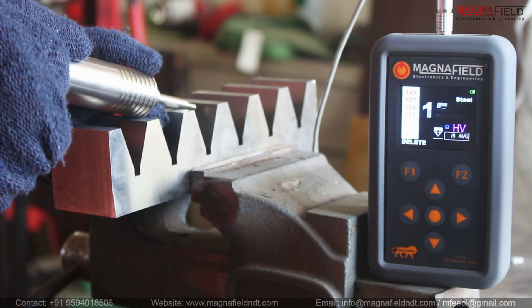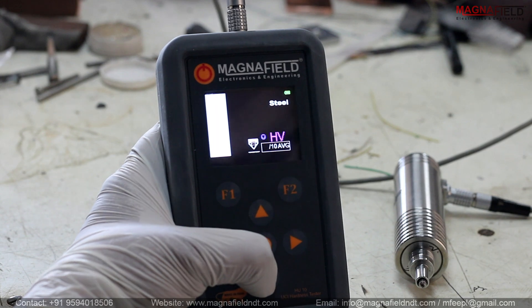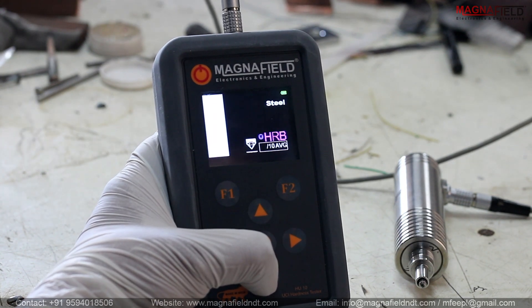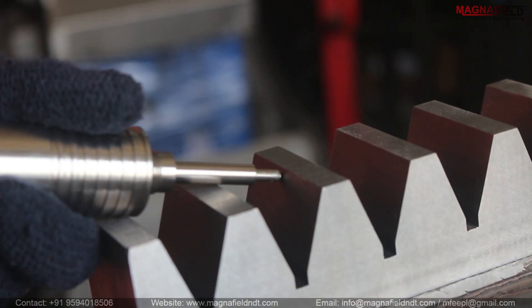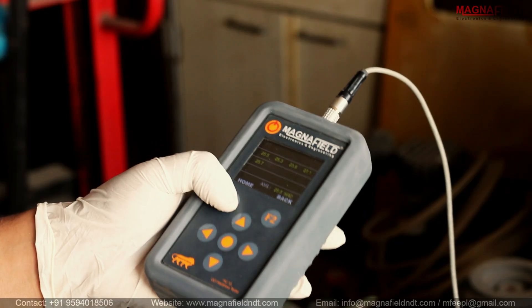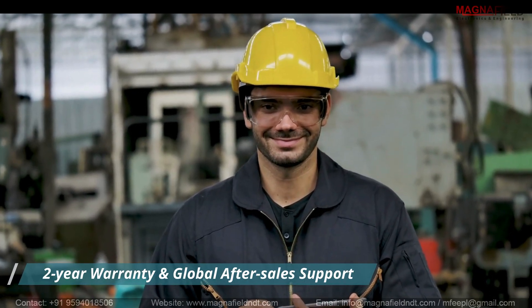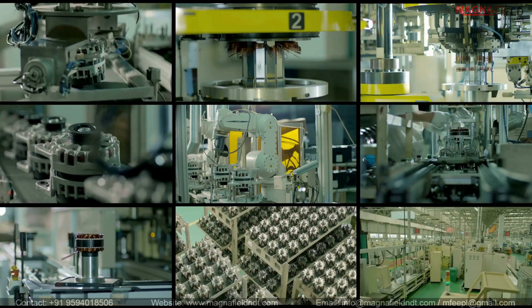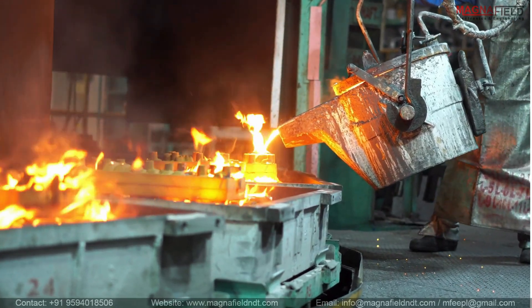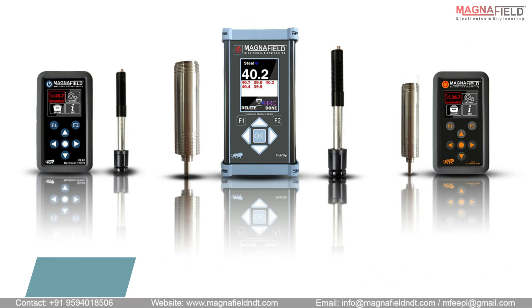In summary, Magnafield's HU10 UCI Hardness Tester embodies a user-friendly design, featuring multiple measurement modes, limitless testing angles, storage capacity for up to 150 data sets, and most importantly, delivers highly accurate results. Backed by a generous 2-year warranty and comprehensive global after-sales support, it stands as the ultimate solution for precise and reliable material analysis. Also explore our range of other products, including the HL10 Leib Hardness Tester and MetaTip Combined Hardness Tester. Thanks for listening.